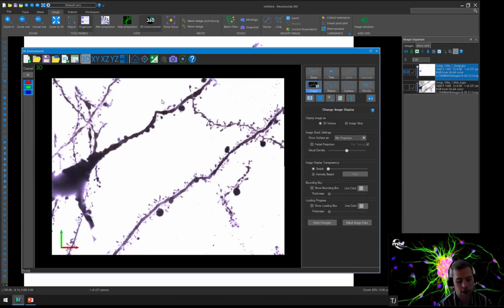Essentially, the takeaway that I want people to have with this is that your image data took time to create. You're going through all the necessary steps to generate your data so that you can start to work with your experiment and collect your quantitative results. If you want to apply these image filters, it's always welcomed. It's nice to be able to further the exactness or ease the frustration of reconstruction, especially when you apply these filters.